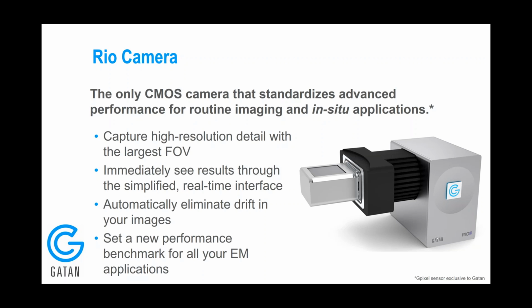For example, you can add the in situ option, and using that do in situ experiments, or collect high-speed continuous tomography data sets, or do STEM diffraction studies.